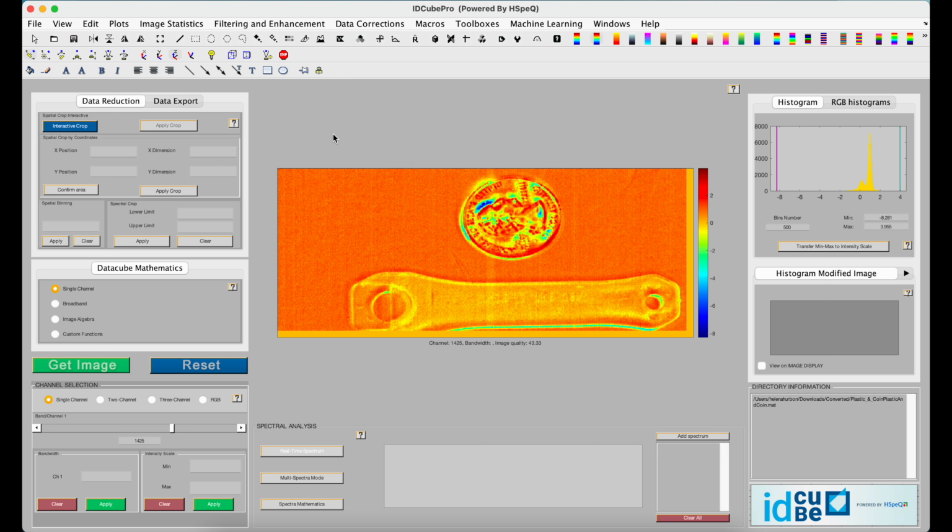It's important to note a few things. This feature performs a normalization of the spectra that consists of subtracting each spectrum by its own mean and dividing it by its own standard deviation. Each pixel will have a mean of 0 and a standard deviation of 1. When using SNV, the spectra always have a positive or negative value centered around 0, which may make interpretation difficult.